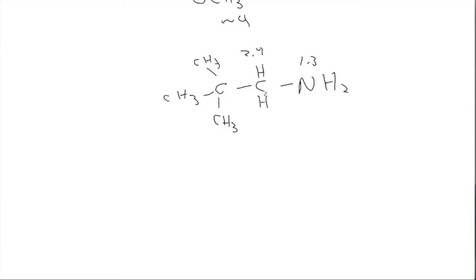Yeah, so I'm a little surprised by some of these peaks. This peak is further to the right than I would expect, and this peak is a little further to the right than I would expect. But this is still the best structure that we can come up with. So we just have to keep in mind that the rules from the tables are not always followed 100% exactly. So if you see a nitrogen, what type of functional groups are possible?